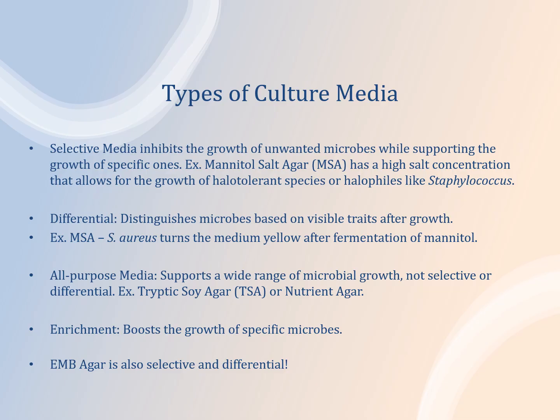So types of culture media. You have selective, differential, all-purpose, and enrichment. Selective media will inhibit the growth of certain organisms while supporting the growth of others. So there's something in the media that causes other bacteria to not be able to grow at all. Differential, you're just looking at the visible traits that occur after your media has been incubated.